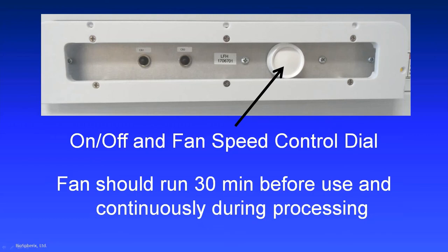This fan should be turned on and run for 30 minutes before you start your process, and just leave it on continuously while you're doing your process. Now, we have had some customers that didn't realize there was even a button back there to turn it on, and it was on the back of their system, and they pushed the Xvivo system right up against the wall, and they didn't even know it was there. So we want to make sure right off the bat that you know there is a button for the LFH and how to turn it on. It's right there.